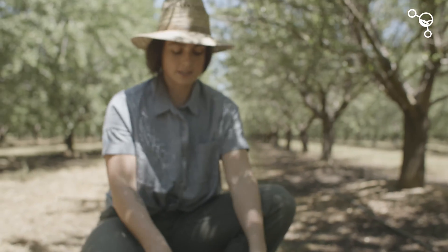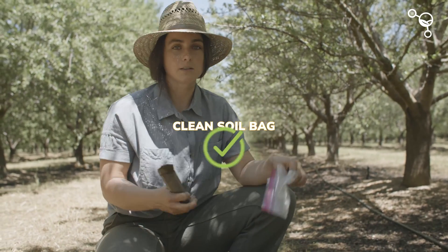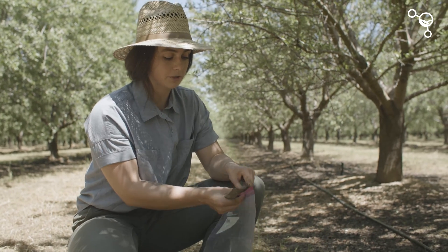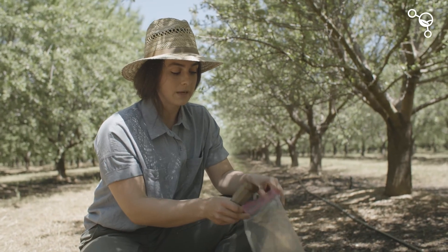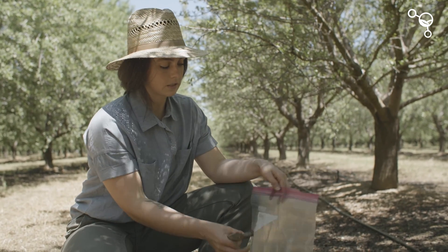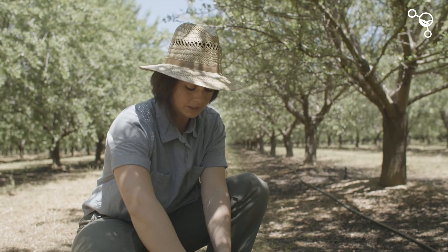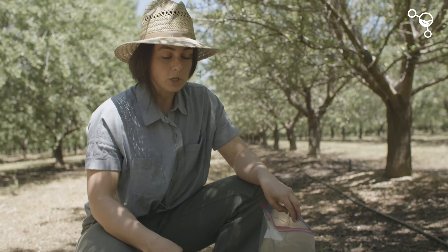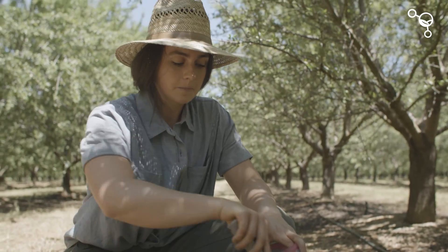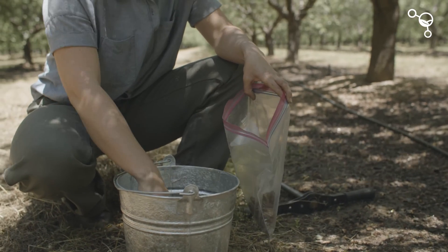Now we've got this nice and homogenized and we're going to collect our one individual sample from this composite using a clean soil bag or a tube if you have your tubes directly. A clean plastic bag is ideal so that we maintain soil conditions during shipping. A Ziploc baggie or any type of plastic bag that'll keep the soil moist and not let it dry out — we don't need a whole lot, just about a half a cup. That's really all we need for biology.